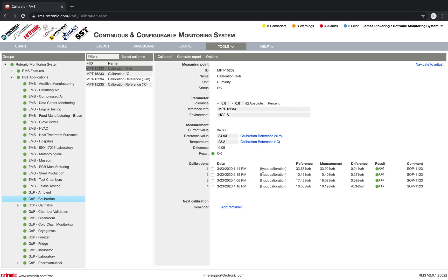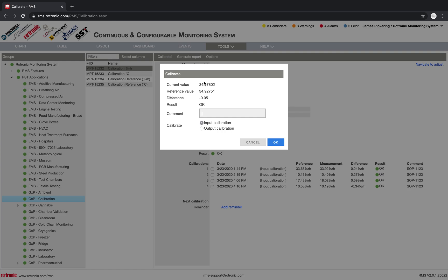And then we can see all of these calibrations. So these are input calibrations. So this means that the calibration was done, no adjustment had been carried out. So an adjustment is when we change the values, not just calibration, we change the values. So these are all input calibrations. So pretty simple here, I just have to click on calibrate. So here I have the current value, a reference value, the difference, I have the result, it's okay. And then I can add a comment.